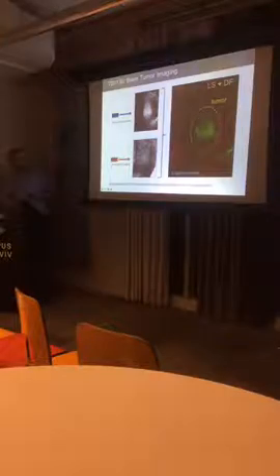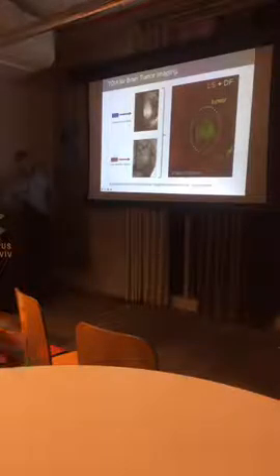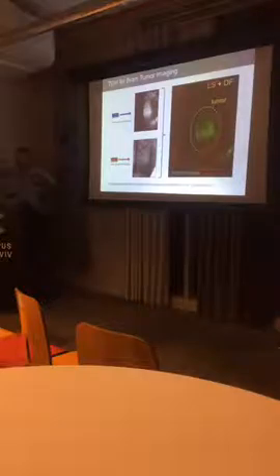This is speckles, and this is fluorescence. So I use the speckles as one modality, and then I overlay another modality. We have a lot of different examples when we combine. And also the TOVI itself was published as a combination modality.